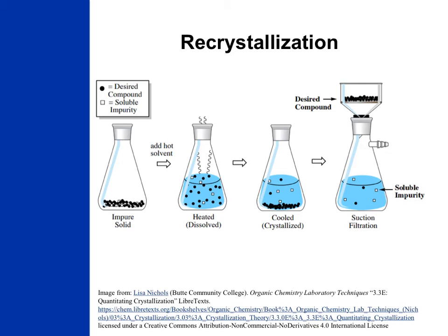Now, one thing we need to worry about when we're synthesizing aspirin is the purity of the product. There are different ways that we can purify our product, and one we'll be using today is called recrystallization.